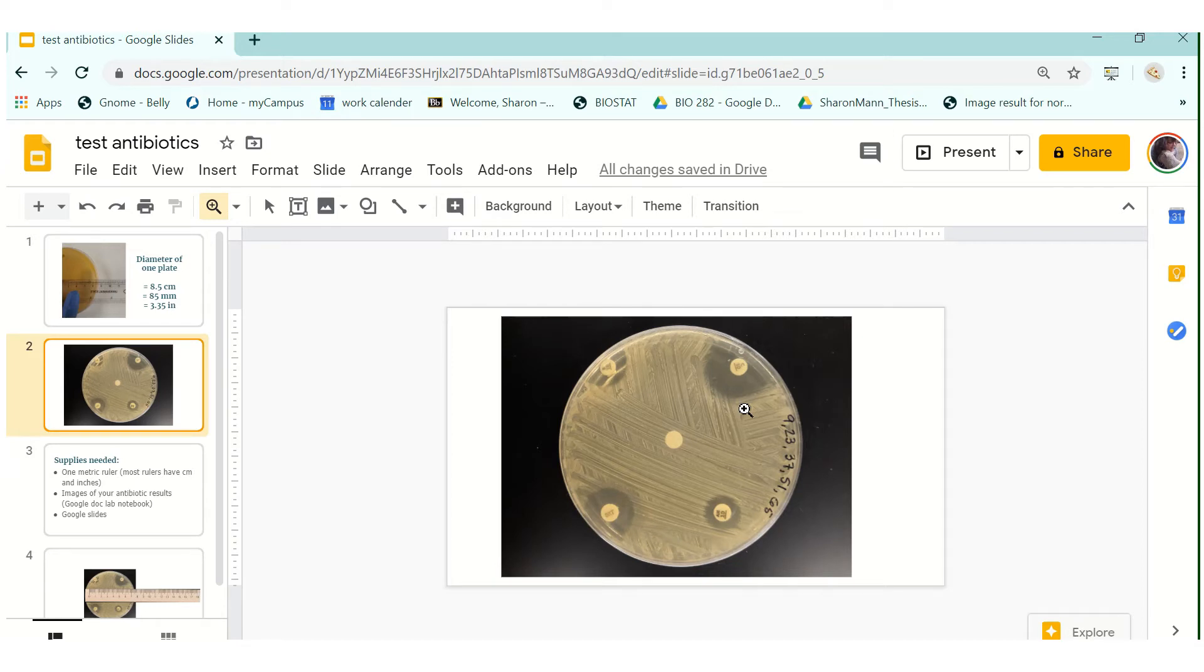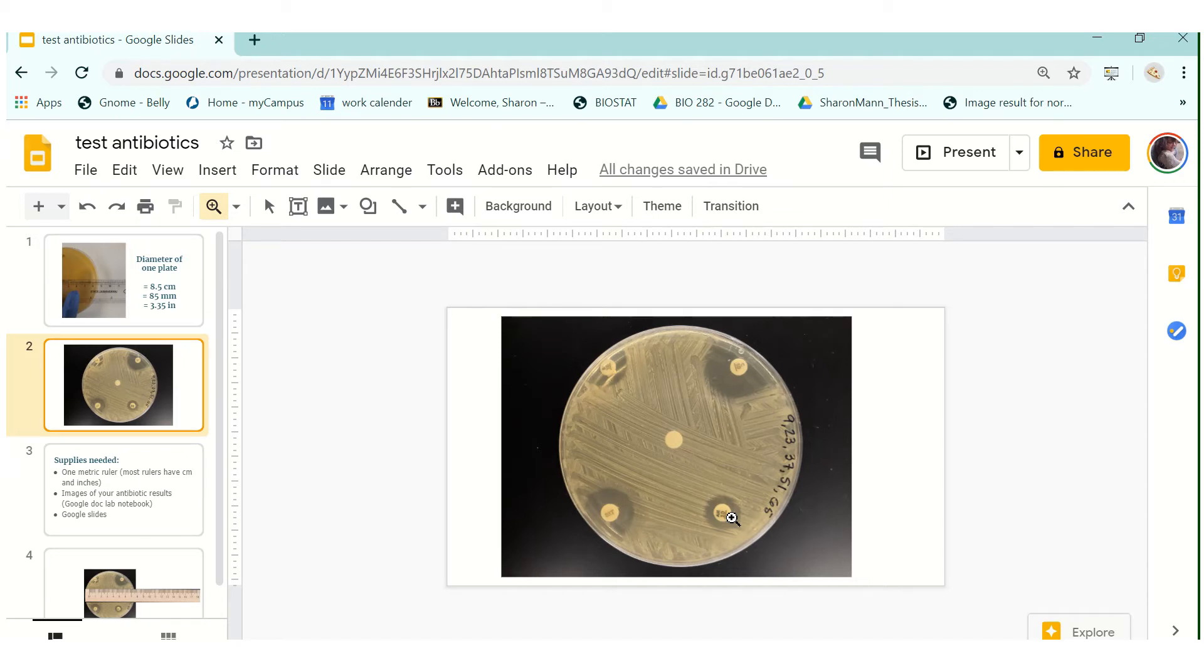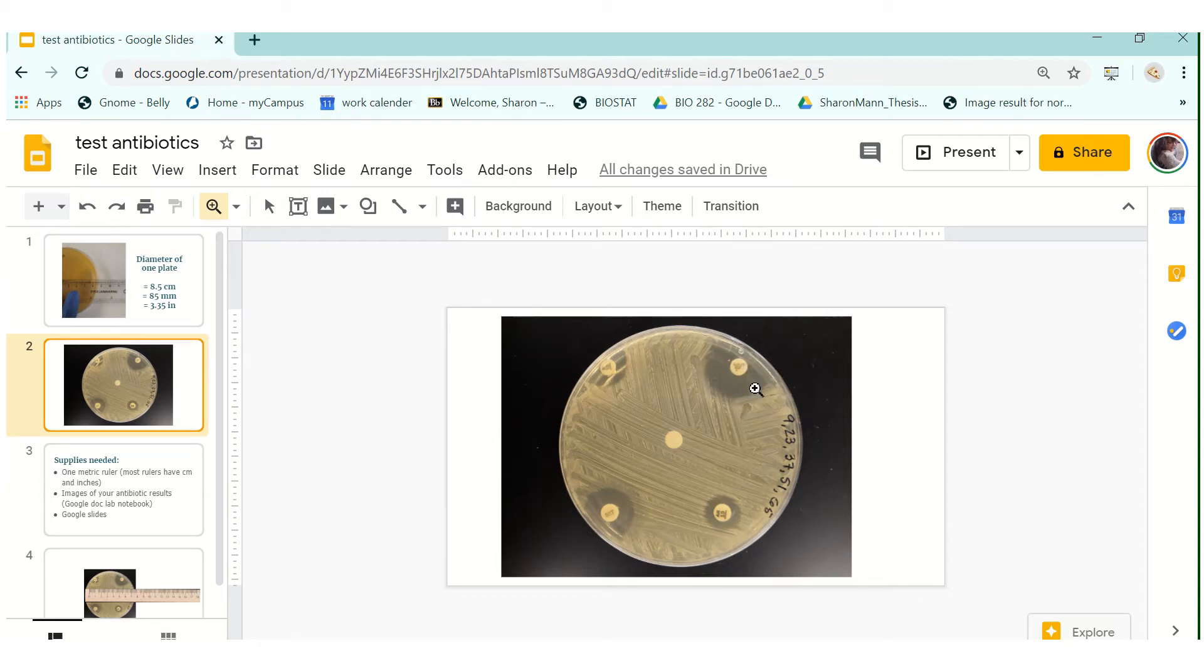Each one of your antibiotic discs has a unique code on it so when you blow up this image you'll be able to tell what your code is and each one of you will also have a table either in your Google Doc lab notebook if you're in Sharon Mann's class or posted somewhere on Blackboard that will have the name of each antibiotic and their unique code. So we can tell that this antibiotic probably had a significant effect on the growth of this microbe whereas this one right here didn't really do much. However we need to quantify that.